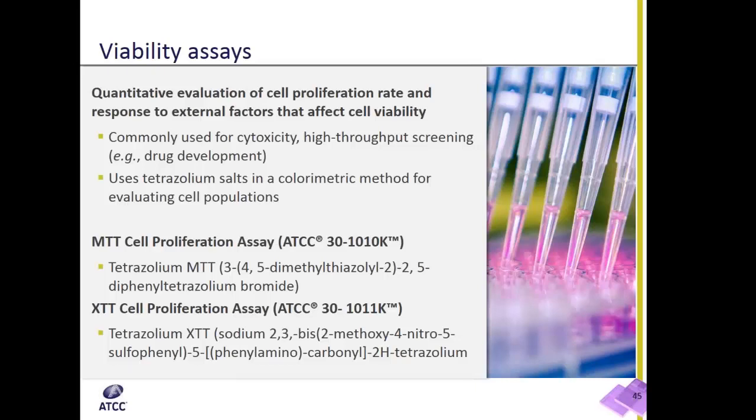There are two assays that we currently have that do this, the MTT and the XTT cell proliferation assays. They both utilize tetrazolium salts to deliver a quantitative analysis of cell culture.